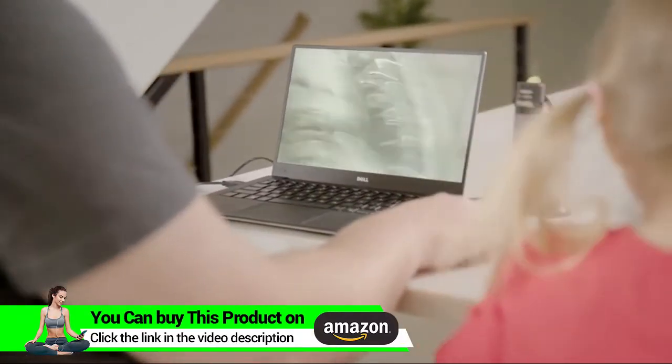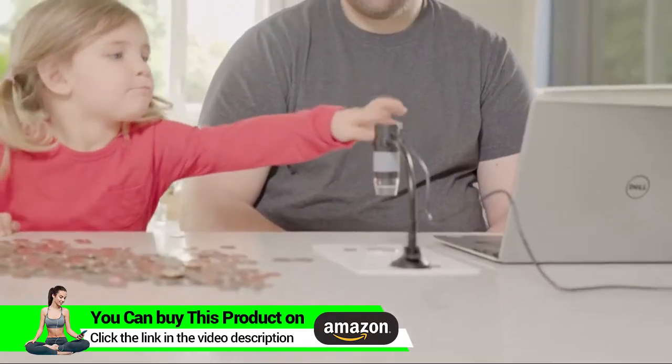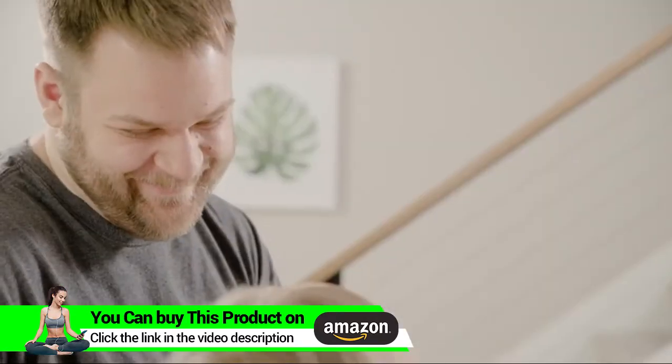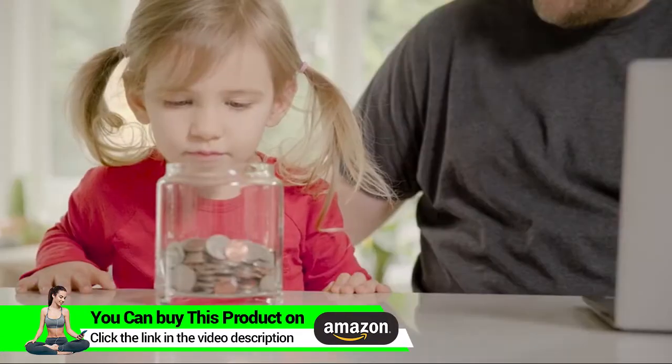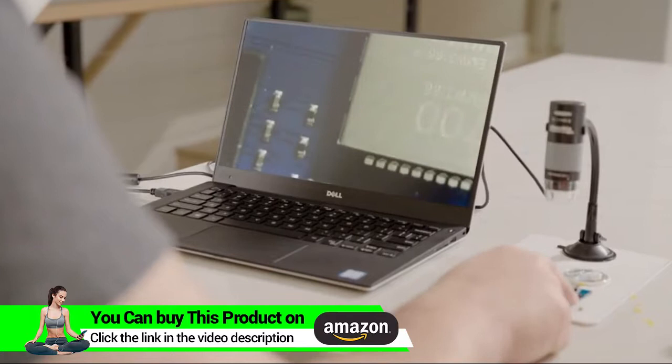Then snap a photo using the capacitive capture button on the top of the microscope, even with the lightest touch. Plugable's Digital Microscope is for students, collectors, and science enthusiasts with a passion for all things microscopic.